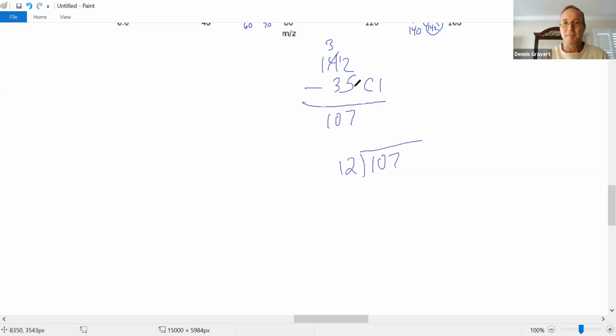Okay, so check my math. 5 plus 7 is 12, that's a 2, carry 1, 3, yeah, 142, excellent. All right, now 107 divided by 12: 9 is 108, 8 is 96, let's check it, 96. 8 times 2 is 16, carry 1, 8, 1 is 9, good. Subtract, that's 11 left over. Cool. C8, H11, Cl.